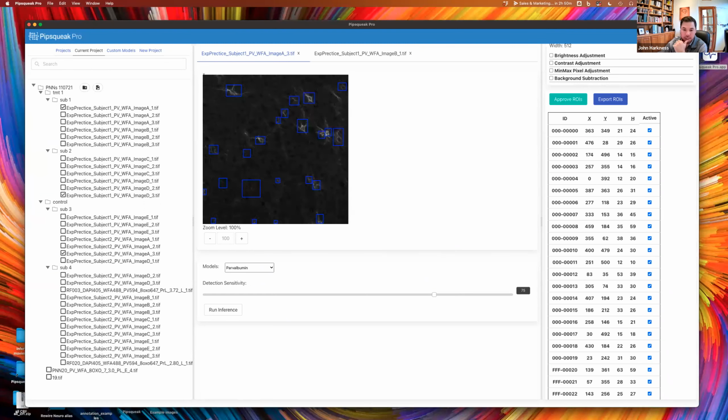Anna, great question here. So the way our AI learns is something that's really important to understand. So we've created an enormous image set of annotations that we've trained, for example, this WFA model off of. So we have about 10 million annotations that went into these models.